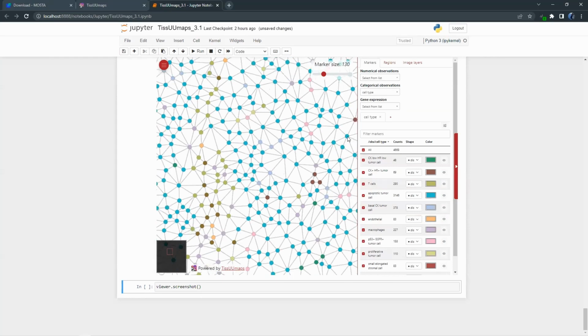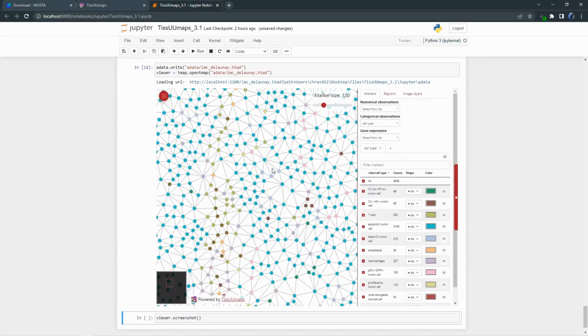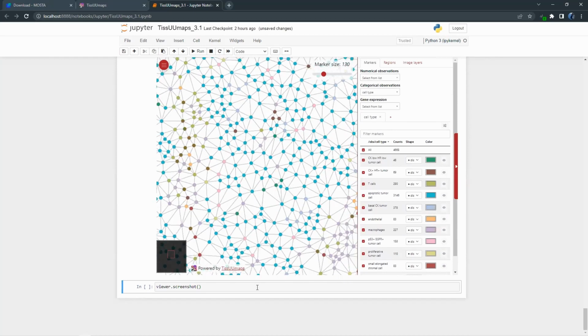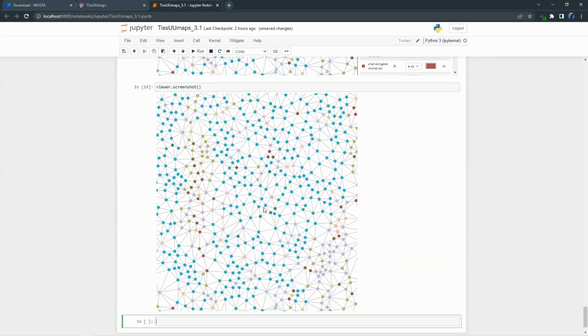You can also load different plugins and everything. So everything works as before, but now we also have the network in the background. And if you have a place where you're really happy about how it looks, you can always also take a screenshot with the network in the background.